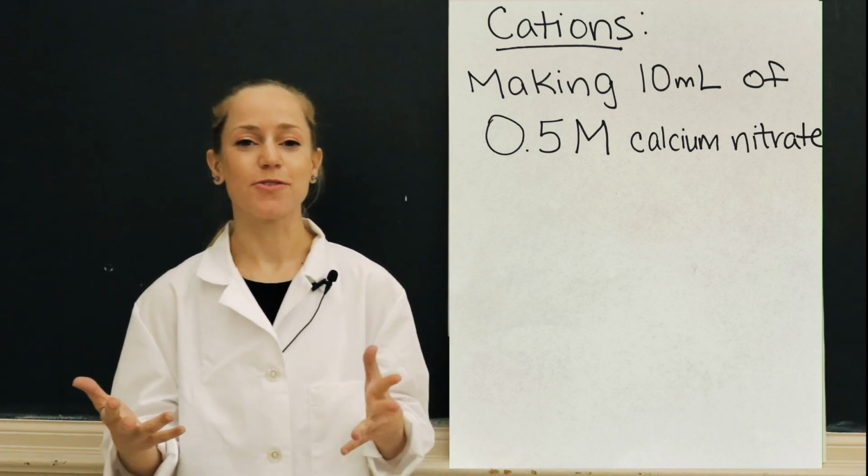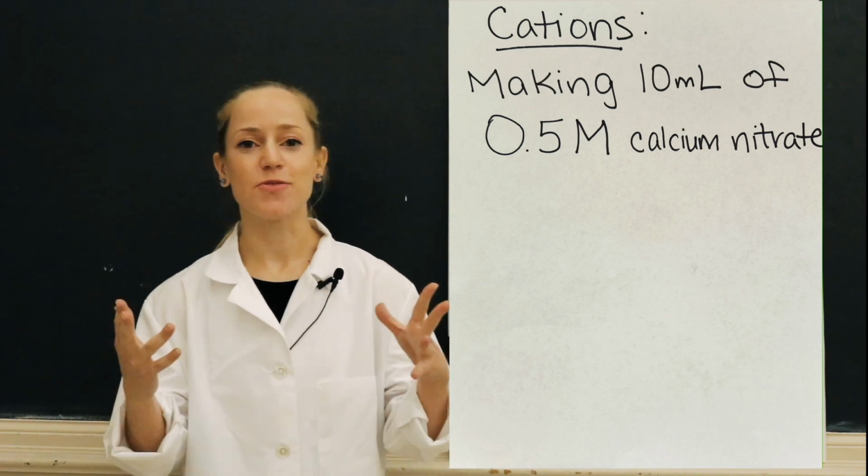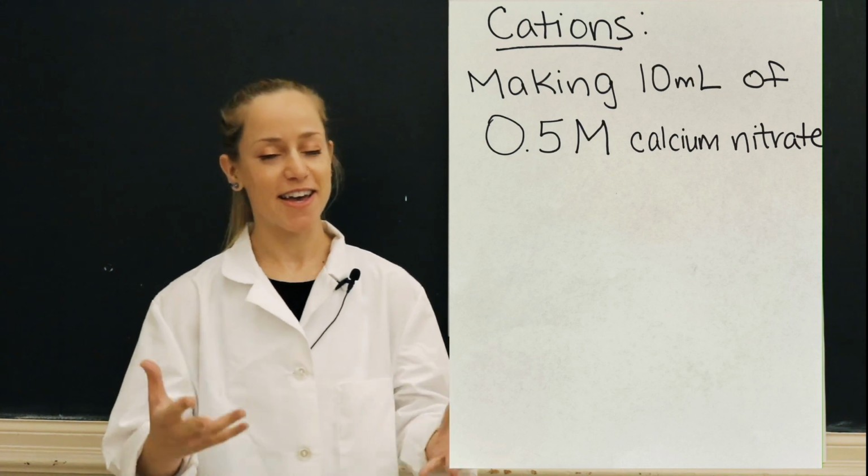I'm going to talk you through Lab 1. In this lab you're going to make a few solutions. Your students can help you make these solutions or you can make these solutions yourself ahead of time.